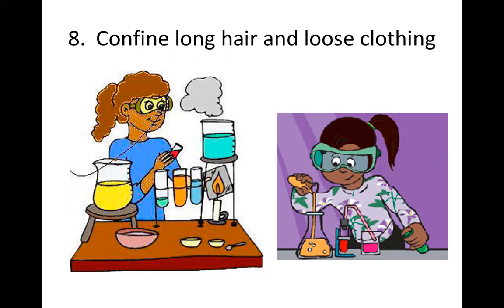And then loose clothing is actually not allowed. Your loose clothing can get caught on glassware, which will cause it to fall. Or sometimes you're handling fire and then your loose clothing can catch fire, or it can get on an acid and then the acid will go to your skin. So loose clothing is not allowed. The same, while inside the laboratory, you have to use closed shoes. So using slippers and open toe sandals are not allowed. Why? Because some chemicals can get spilled and it can go to your open feet. So you have to be using the proper clothing while inside the laboratory.